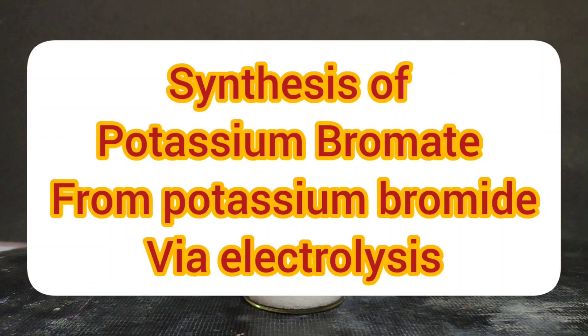In this video, I will be making potassium bromate from potassium bromide by electrolysis method.